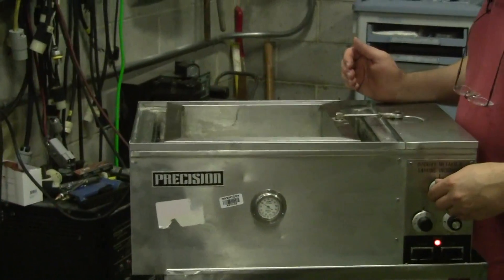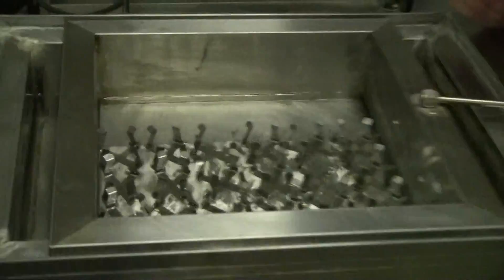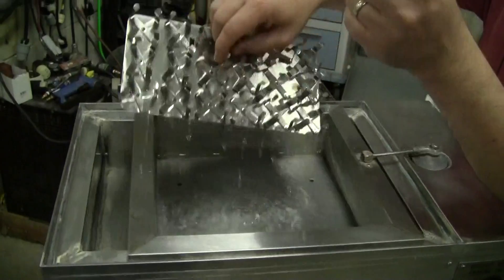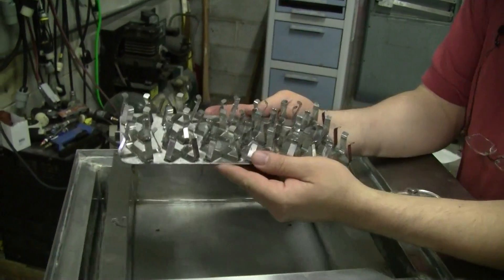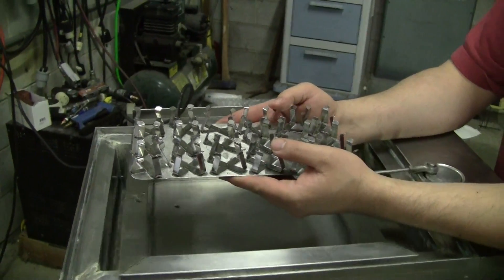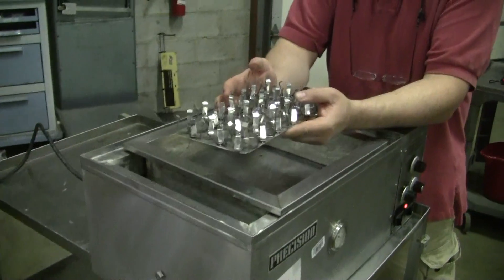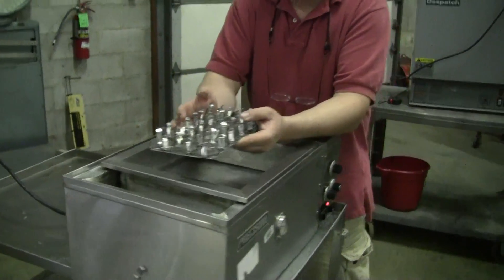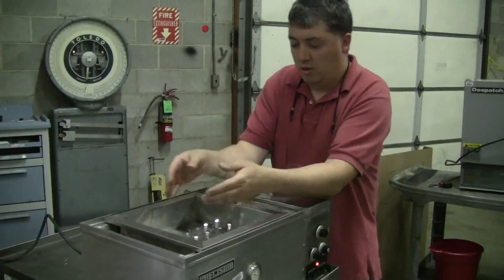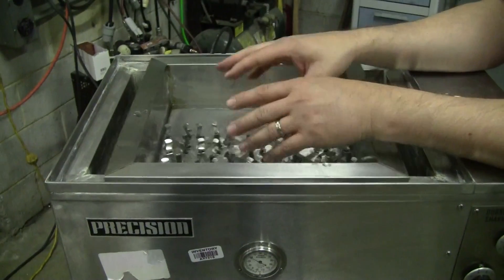Come a little closer and we'll look into it. Most reciprocating and orbital shakers will have sample holders where you can put your Erlenmeyer flasks or beakers. Please specify what you're looking for, because we possibly might have additional holders. Your samples are going to sit in this constant bath and move around.